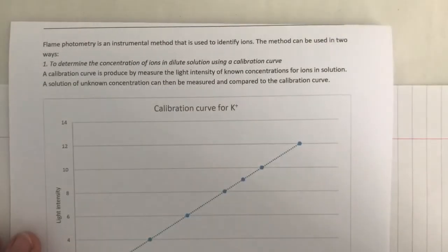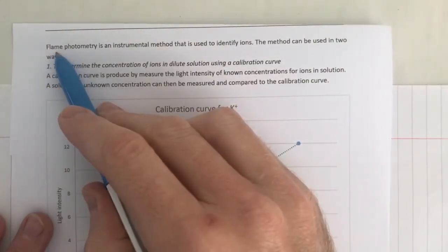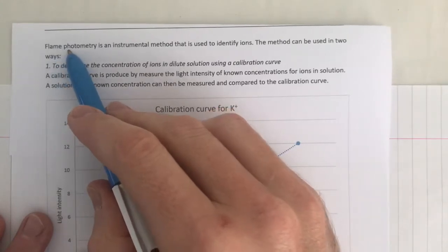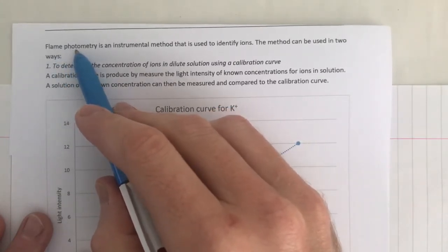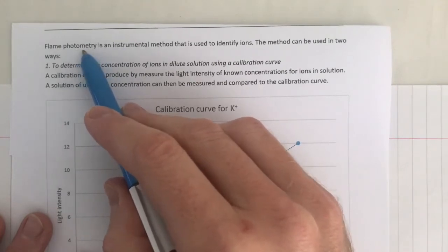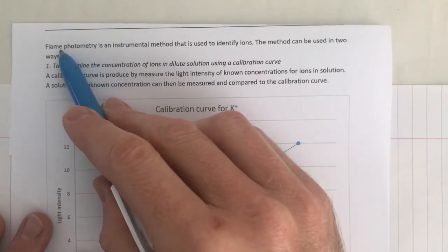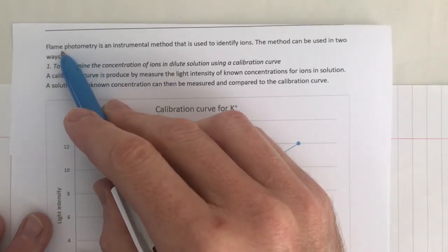Okay, flame photometry is an instrumental method that can be used to identify ions. Before we look at the methods, let's explain what this means. This is a bit like a flame test that you will have seen and carried out in class yourself. Photometry: photo means light, and the metry bit means we're measuring. So we're measuring the amount of light that's been generated by what's called an instrumental flame analysis. Okay, that's what we're doing.